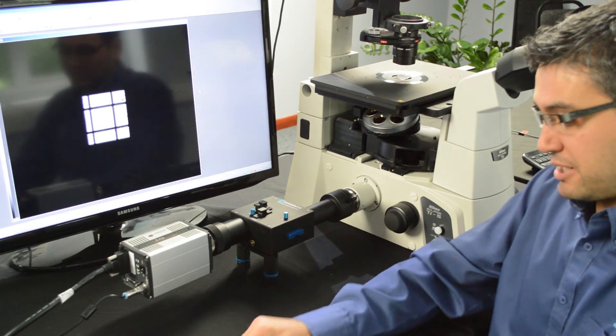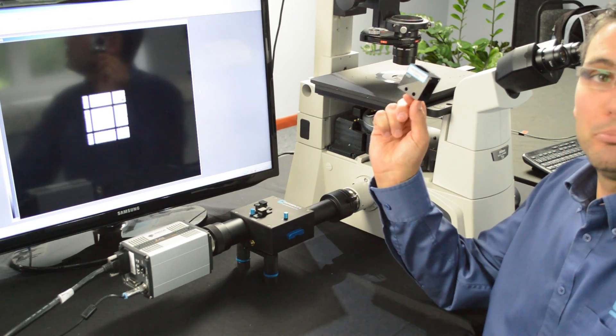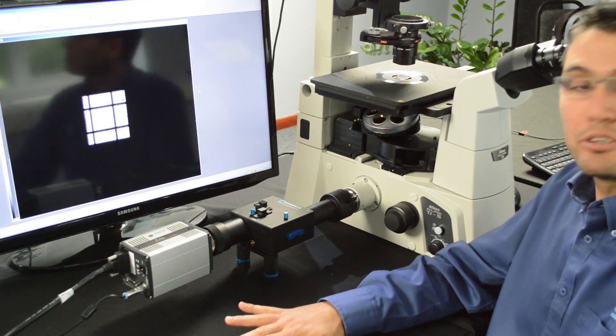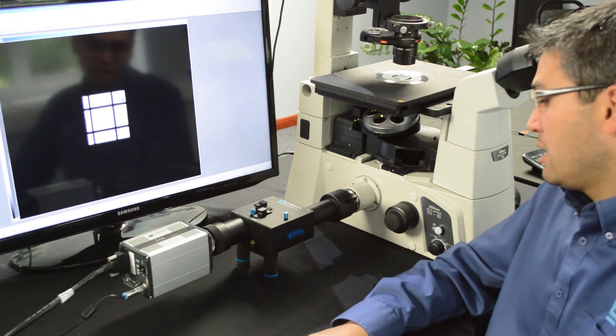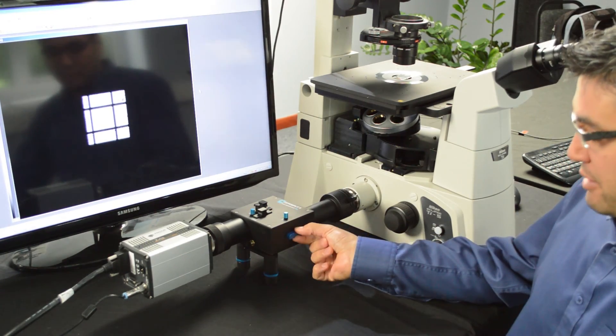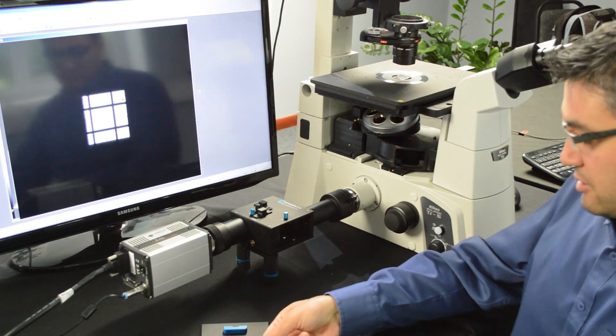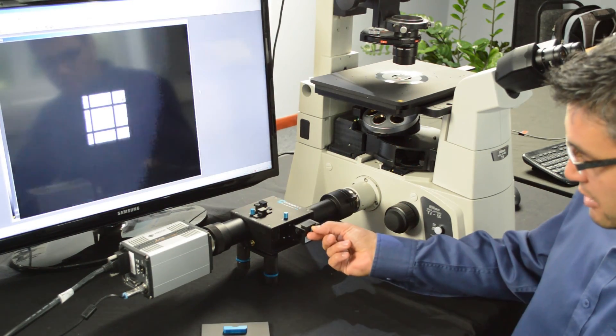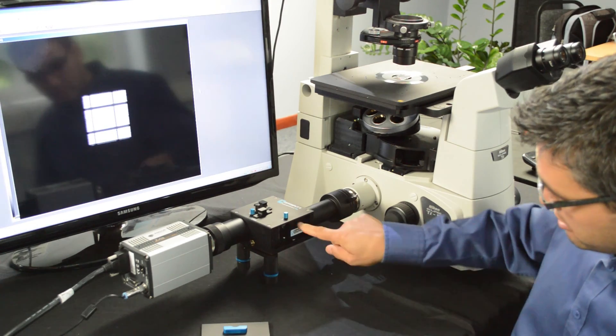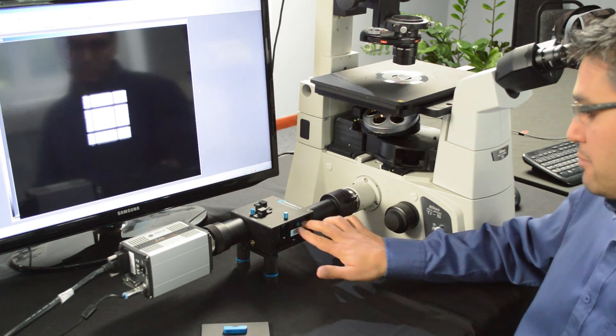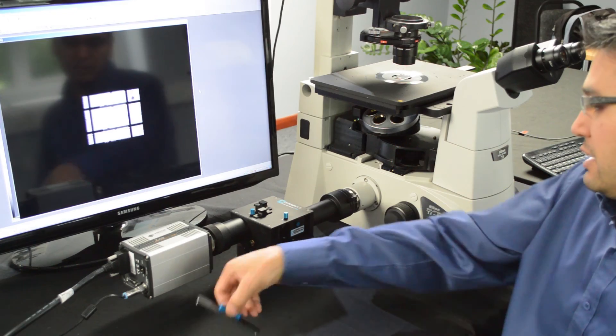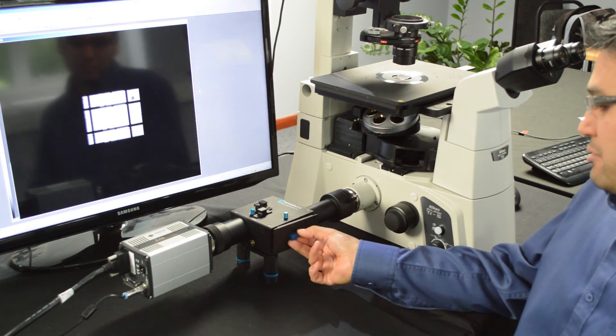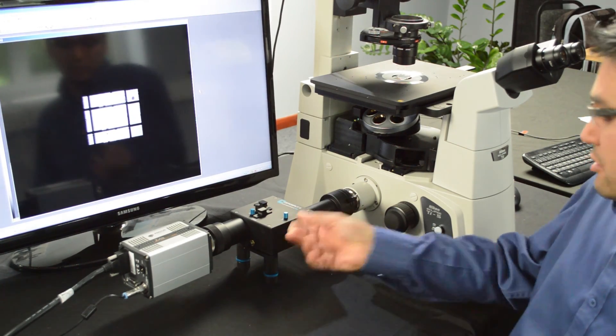So your OptiSplit comes with a calibration cube that's what we're going to be using to set up the system. Just open the cover, it's magnetic, just pull it and slot your calibration cube into the grooves. Make sure that it's nice and tight. Put the cover back so you don't have excessive light in your system.